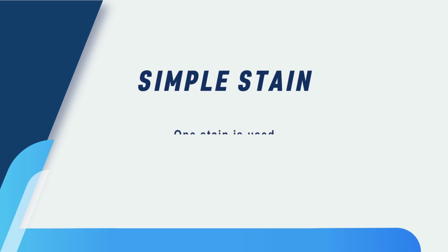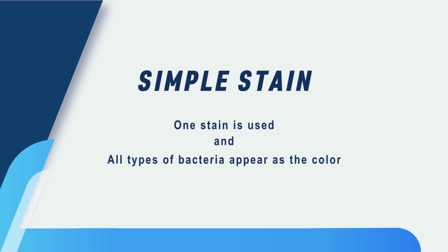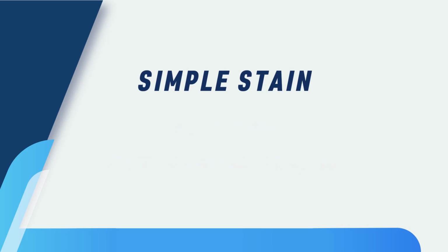In a simple stain, only one stain is used, and all types of bacteria appear as the color of that stain when viewed under the microscope. Simple stains can be used to determine a bacterial species' morphology and arrangement, but they do not give any additional information.